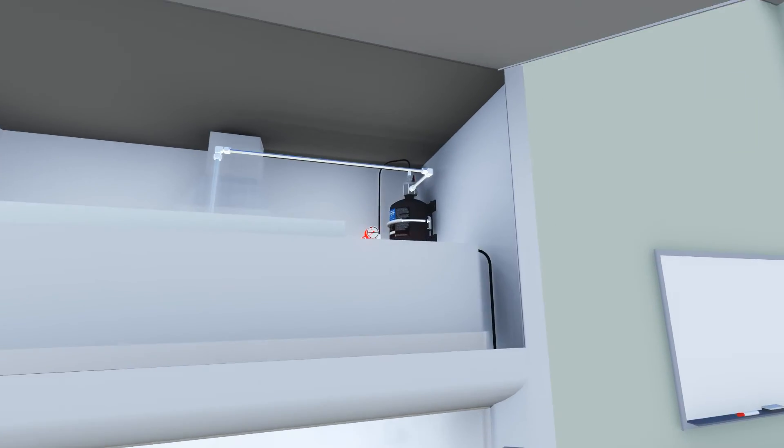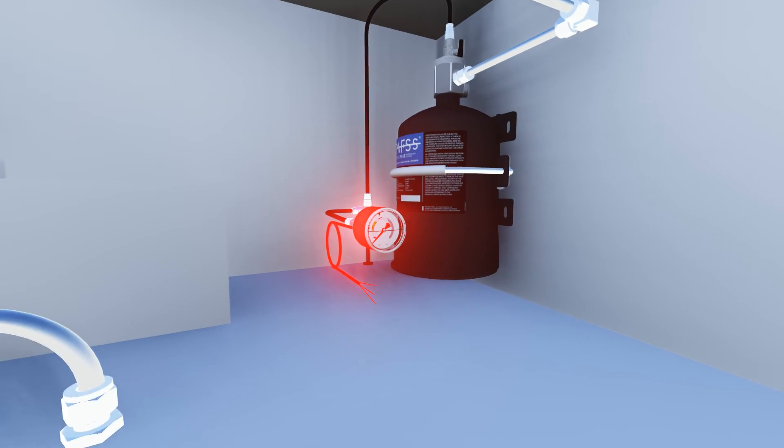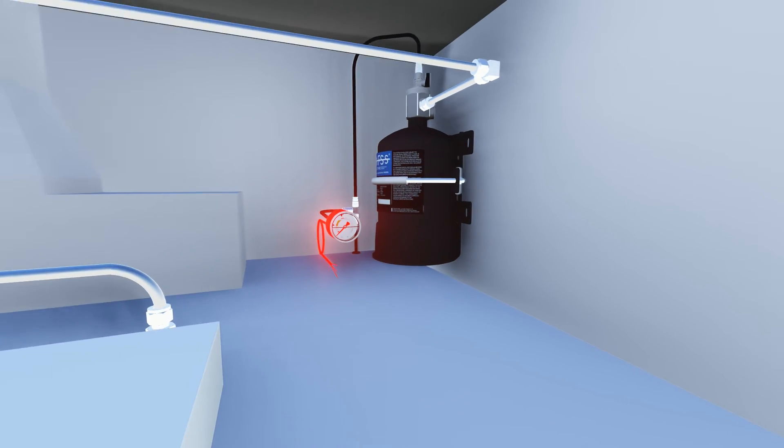Pressure switches and pressure gauges can be used to monitor system pressure and for system discharge confirmation. These signals can be used to sound an alarm or shut down services to the fume cupboard upon discharge of the system.